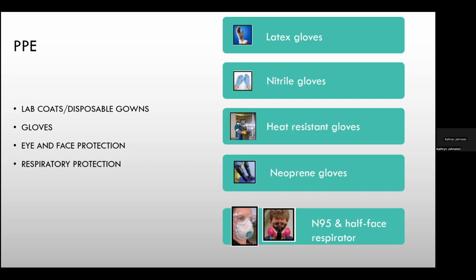Well, one type of glove does not work for all types of hazards. So latex gloves are suitable for wear while working with some of the biological hazards and infectious materials, but latex can cause allergy problems in some individuals. So as an alternative, a lot of healthcare workers now will wear nitrile gloves. They're 3 times more puncture resistant, and they provide superior resistance to many kinds of chemicals. So it is a good alternative, especially if you're working with the low and intermediate level disinfectants in the laboratory.